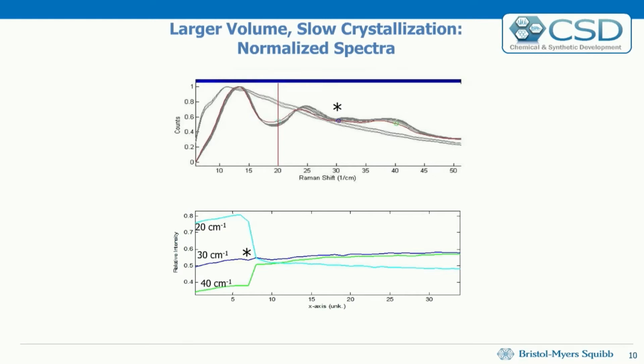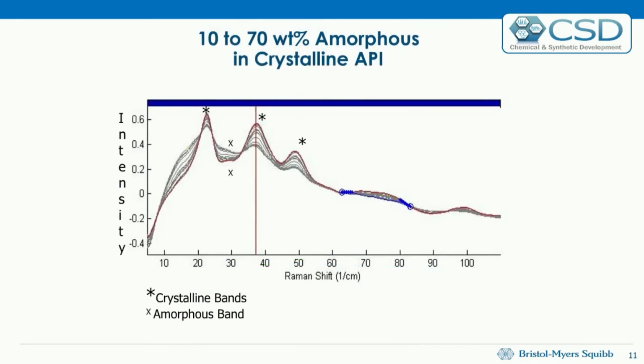In my particular case, I would monitor both, since we can monitor a number of wavelengths simultaneously, build a model off of it, and you could see over a period of time, we're actually going from amorphous to crystalline material depending on the temperature and the conditions that we have it under in a slurry, for example. So these are some of the stages that can occur, and we're going to monitor them in order to make a nice, desirable crystalline material.